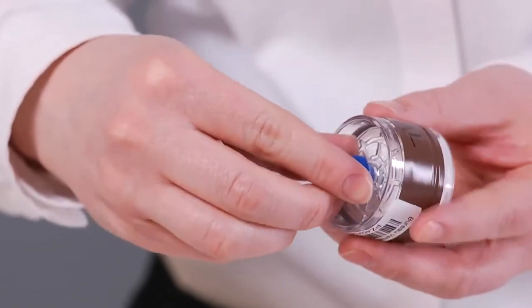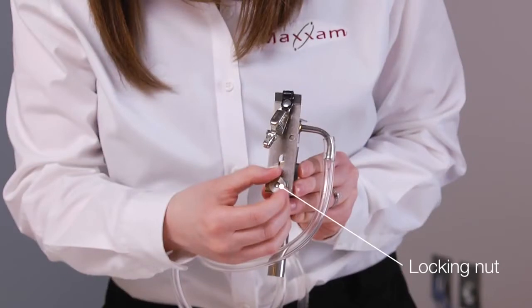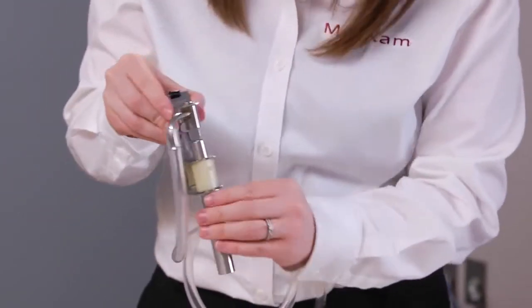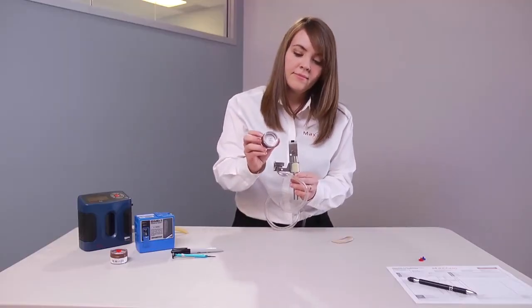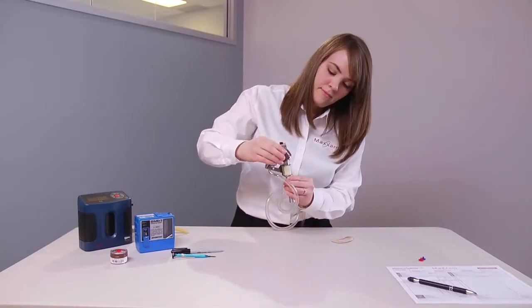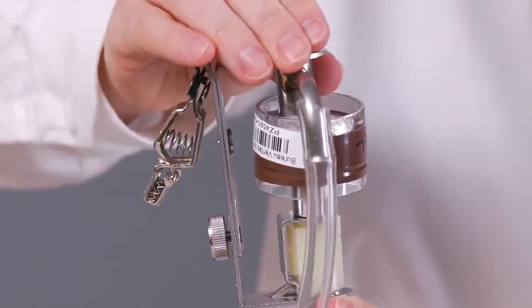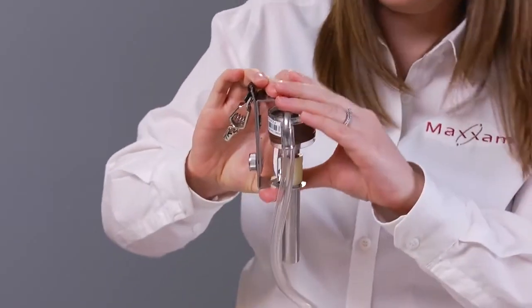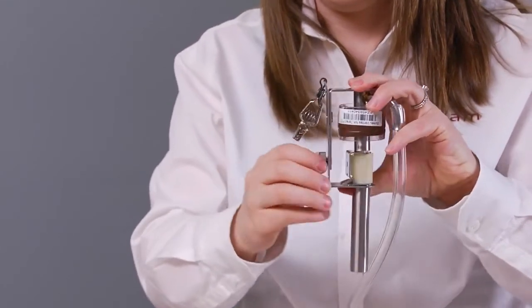Remove the plugs from both the cassette outlet and inlet and set them aside. Loosen the locking nut on the back of the cyclone holder and slide the upper bracket up and over. The side of the cassette labeled inlet should be pointed downward and inserted into the coupler. Now slide the upper bracket down onto the outlet side of the cassette, press the upper bracket onto the cassette, and tighten using the locking nut.